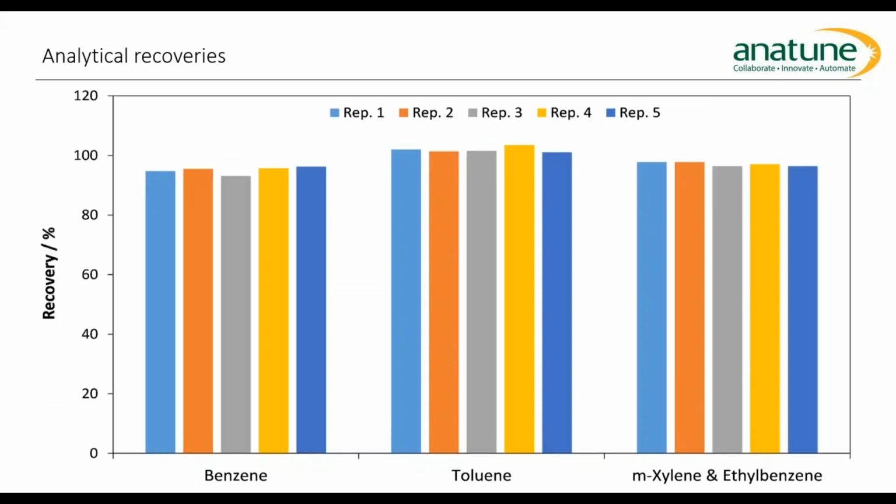And just to show that the recoveries from this are very good, when we back calculated these concentrations, we recovered close to 100% of what we expected to see for these analytical recoveries.